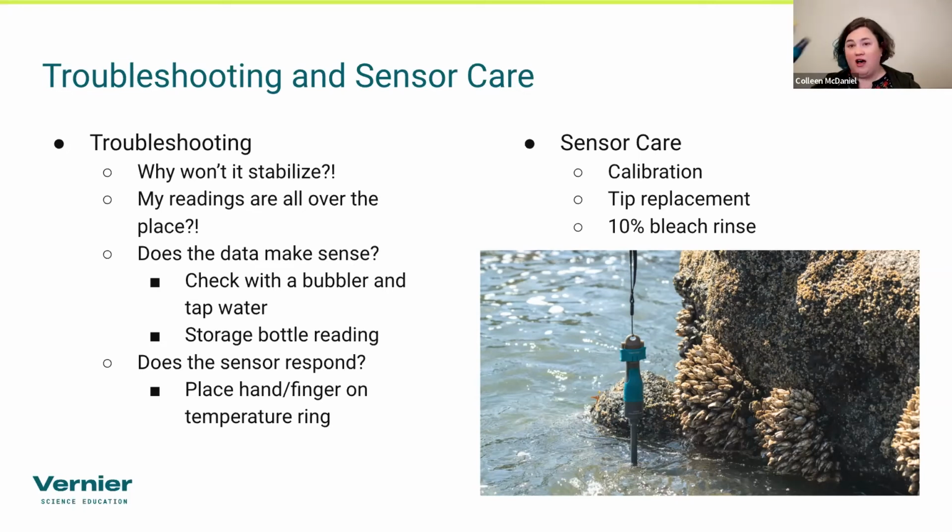With the optical versions, there is no calibration, but there is what we call a reset. And the reset is kind of what I was talking about, where you want to bring them all back in line with each other reading wise. So with a reset, the process is you actually take distilled water and fill up the cap until the sponge is submerged in distilled water.